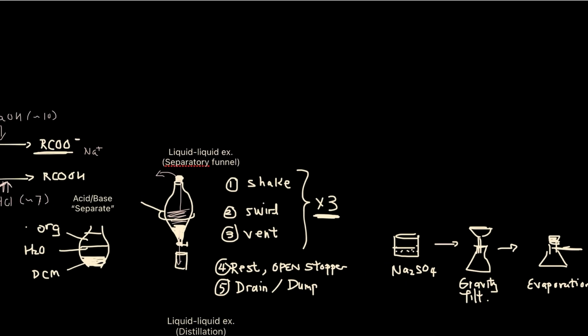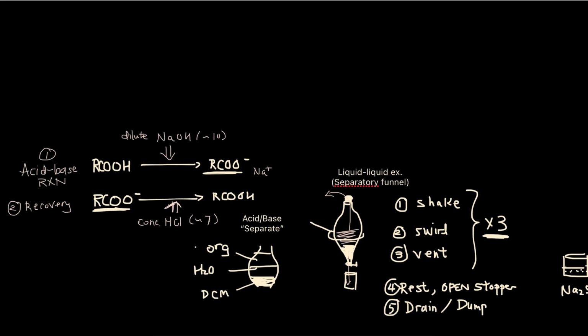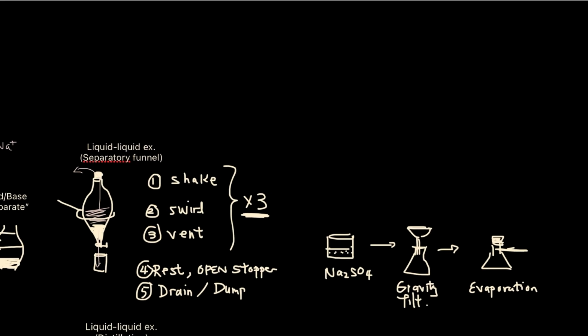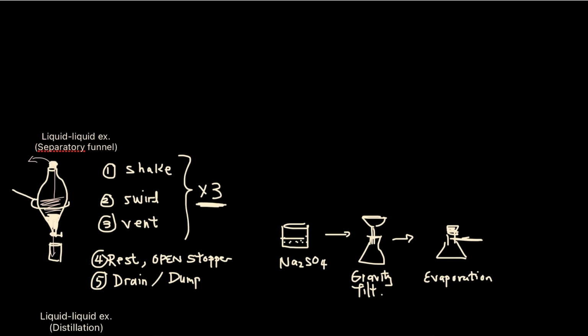Okay, so on the exam, things to mention: obviously the theory, the layers, how to use a separatory funnel. Make sure to mention these steps. And also don't forget about gravity filtration and evaporation and the purpose of sodium sulfate.